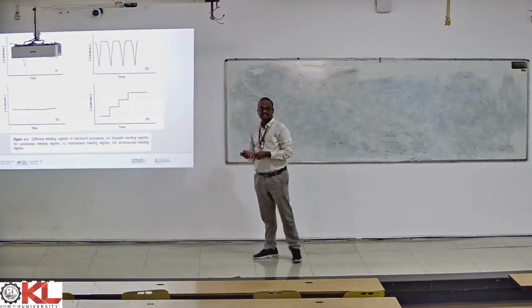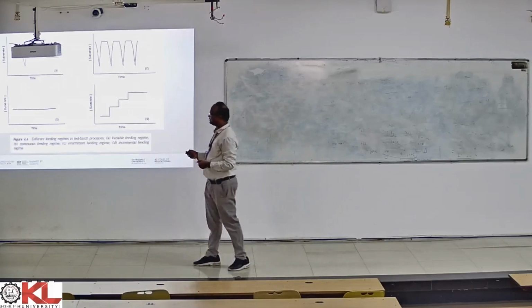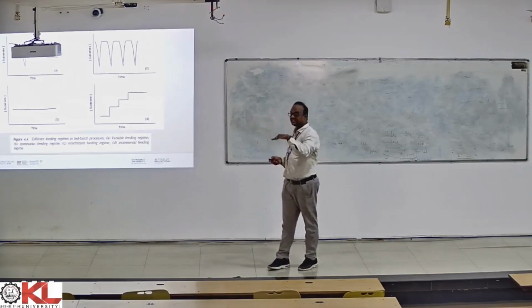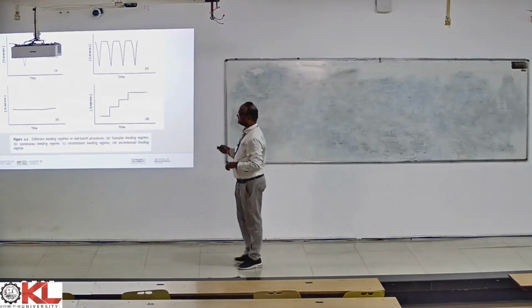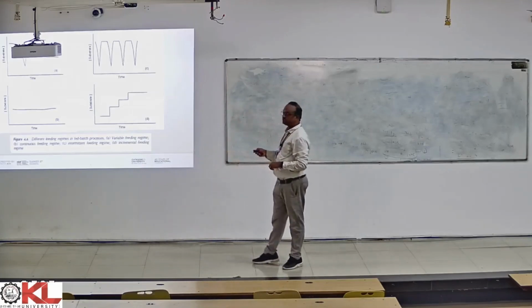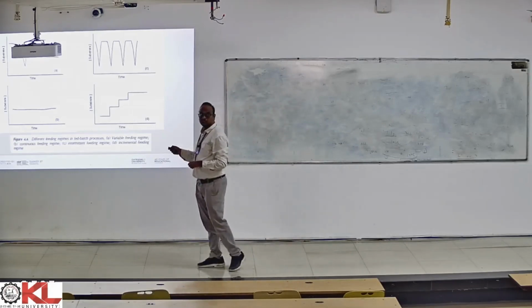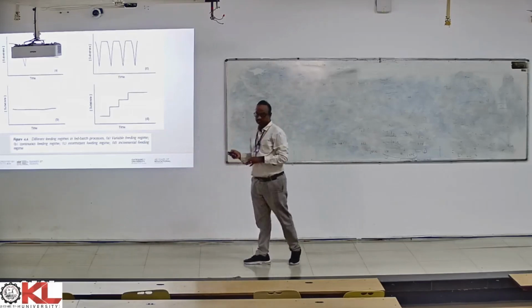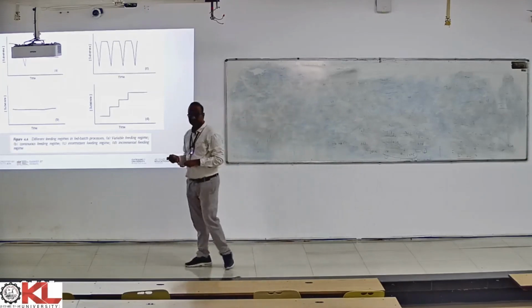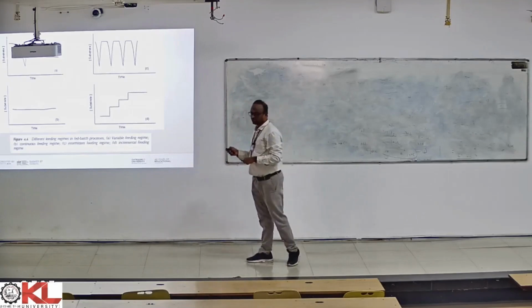These are nothing but the feeding regimes, that is, how we are going to feed the bioreactor. The first picture is called the variable feeding regime. That means we vary the amount of feed that we send into the bioreactor. If you see here, we have decreased the amount of feed and then slowly increased it. We operate in this mode because we run the bioreactor based on the growth rate of the microorganisms.